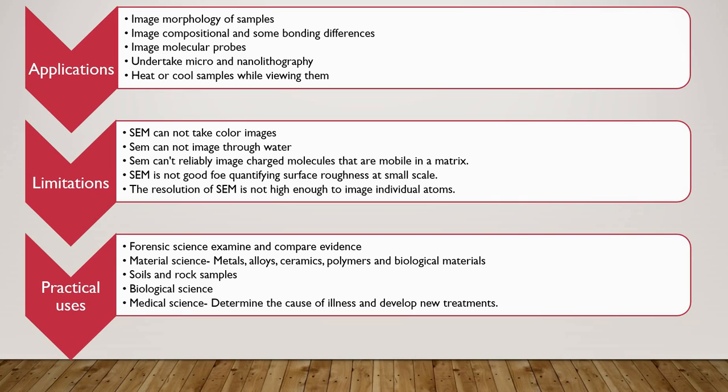Then soils and rock samples. Then medical science. In that, determine the cause of illness and develop new treatments. Then digital art, images taken from the SEM that have been modified as digital art. So these are the applications, limitations and practical uses of SEM.